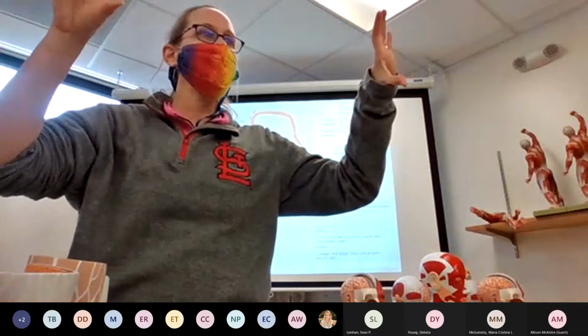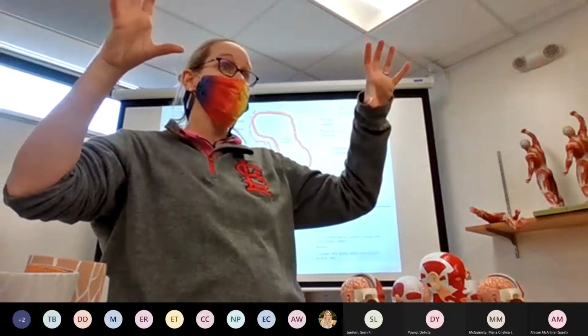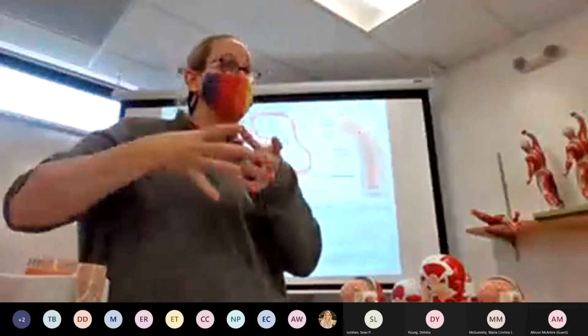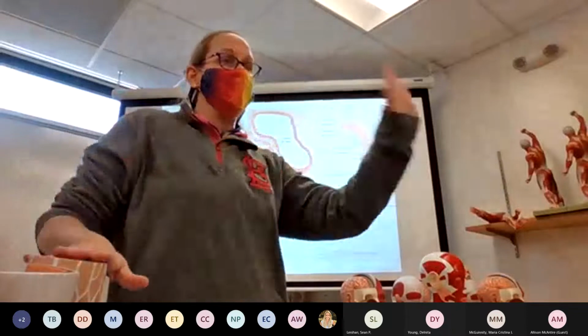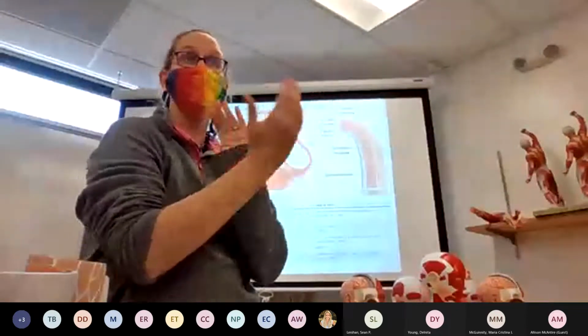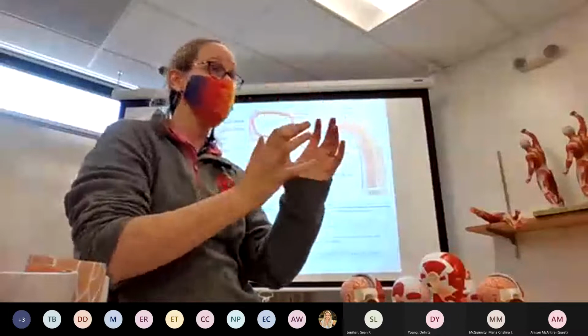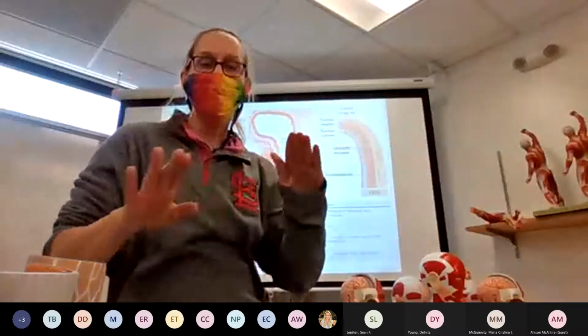On the artery side, you're going to see those internal elastic and external elastic membranes go away, and the muscle becomes important. Then when you go to the arterioles, there's no more tunica externa. You're down to 1 to 2 layers of contractile smooth muscle cells and the intima. On the vein side, a very small amount of tunica externa, maybe a few random smooth muscle cells in there, and the tunica intima.